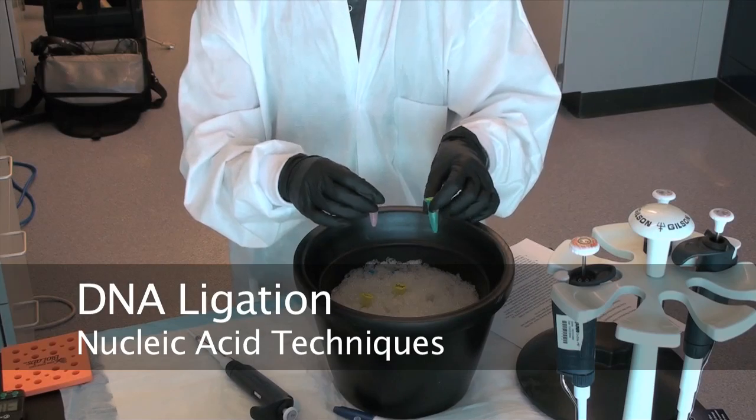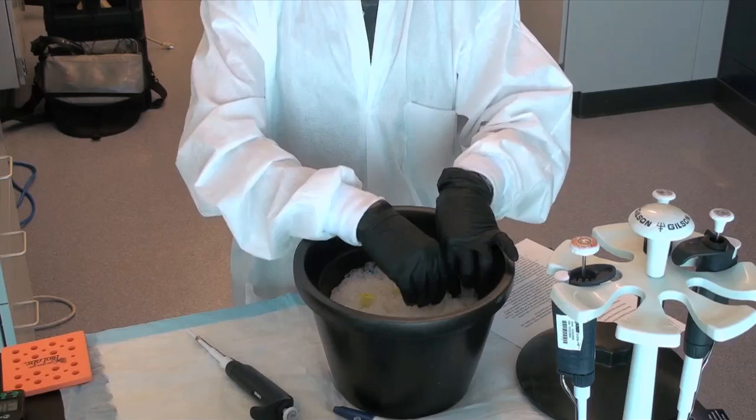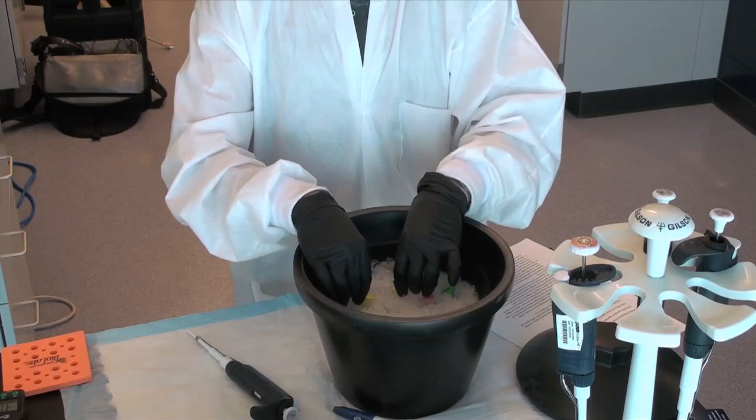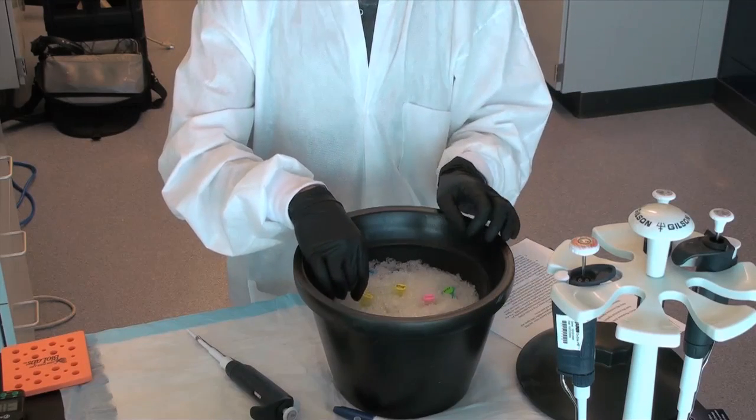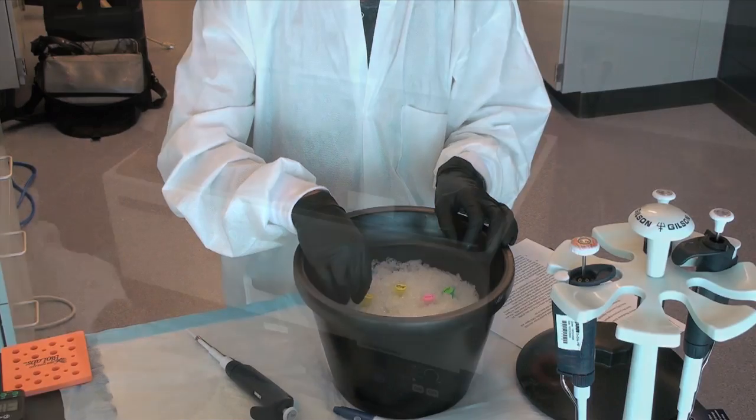DNA ligation. Step 1: Take restriction-digested and enzyme-deactivated plasmid vector and DNA insert, antarctic phosphatase, antarctic phosphatase buffer, DNA ligase, and ligase buffer out of negative 20 degrees Celsius freezer and place on ice.